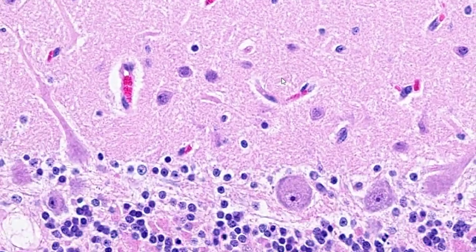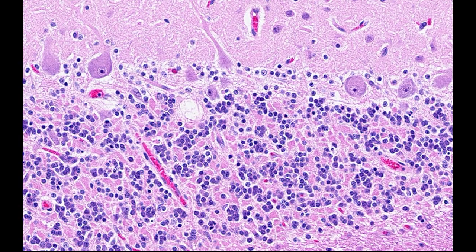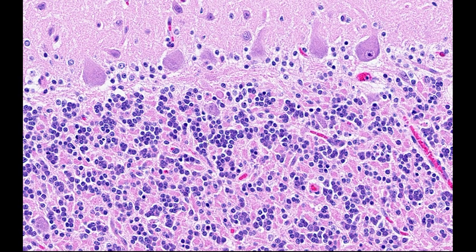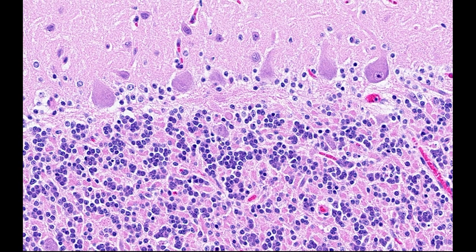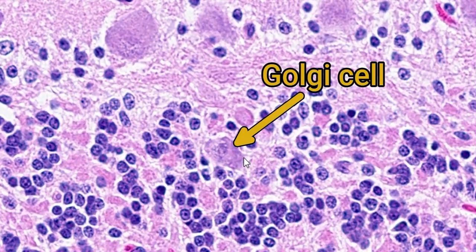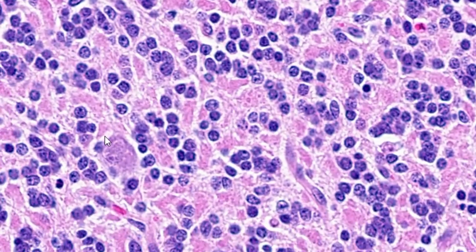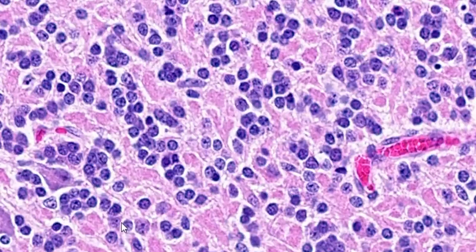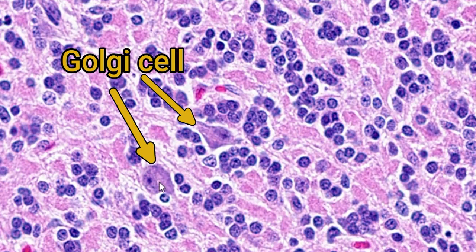The final type of neuron we're going to talk about is the Golgi cell. These are located in the granular layer and are medium-sized neurons, so they're quite easy to spot amongst the much smaller granule cells. Their function is to inhibit and modulate the activity of the granule cells, and they receive input from both mossy fibres and parallel fibres. There's an example here — you can see it's quite a large cell with lots of cytoplasm. Just over here we've got ones that are a bit better preserved; we can just about make out the nucleus with a nucleolus and the typical enlarged cytoplasm of a neuron. So this is a Golgi cell.